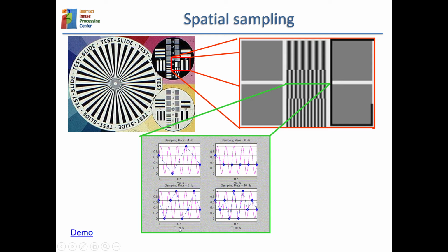So that means that we are not fulfilling the Nyquist criterion, and then we will never be able to identify that the underlying wave has this period. So that is, for instance, here it is very obvious. From the samples alone, we would think that what we have is a much smoother wave.